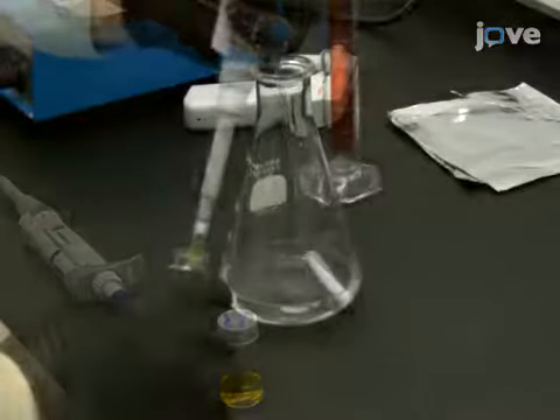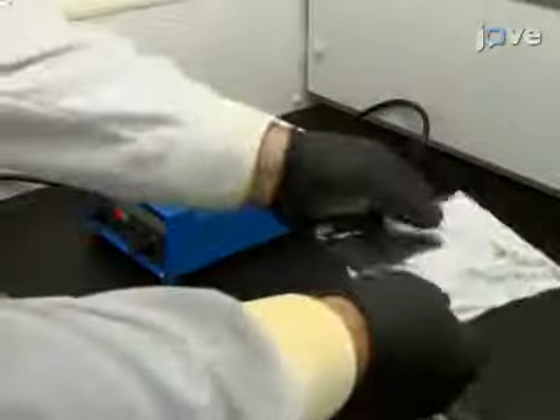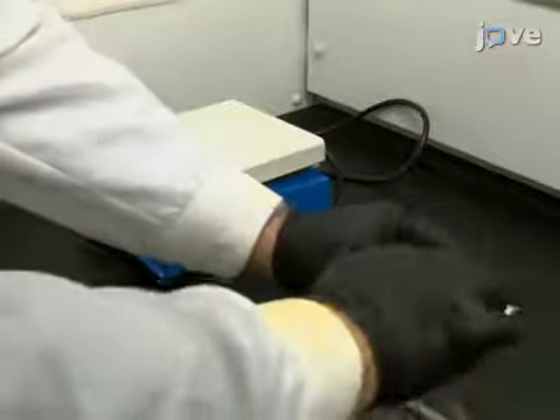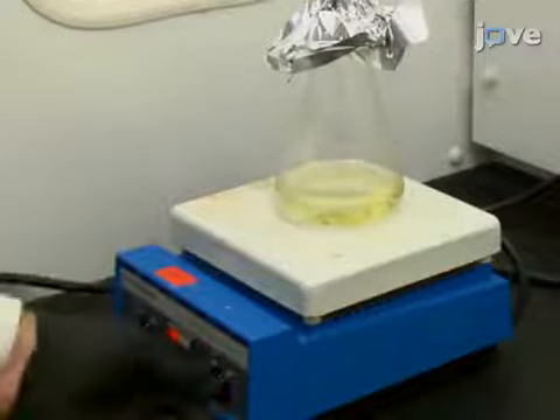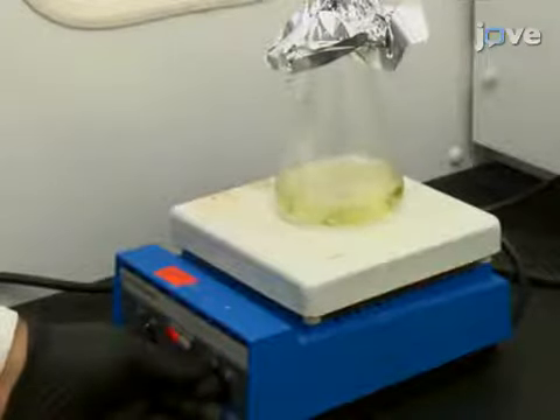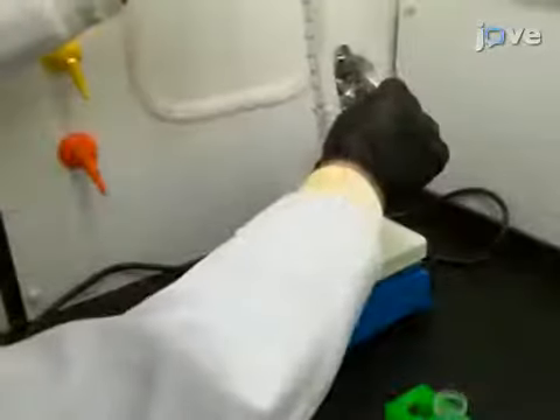Add 100 milliliters of 1-millimolar gold 3 chloride. Use a sheet of aluminum foil to cover the top of the acid-cleaned Erlenmeyer flask and heat with continuous stirring on a hot plate until boiling. Next, add 10 milliliters of 38.8-millimolar sodium citrate.